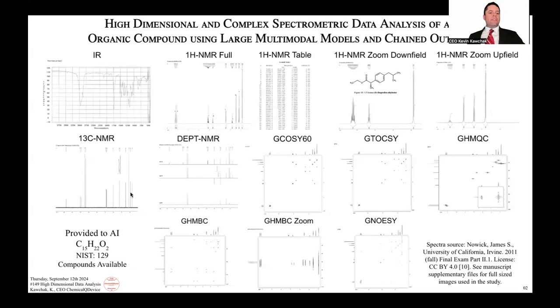And likewise with the C13, we see that carbonyl way downfield from the ester group where it should be, not being that tall, which is stereotypical of that specific type of carbon resonance. And then the two C groups off the aromatic ring that are quaternary, and then we see the other CHs that are taller there, and then the solvent peak. And this next one would be this diastereotopic carbon having the diastereotopic protons.